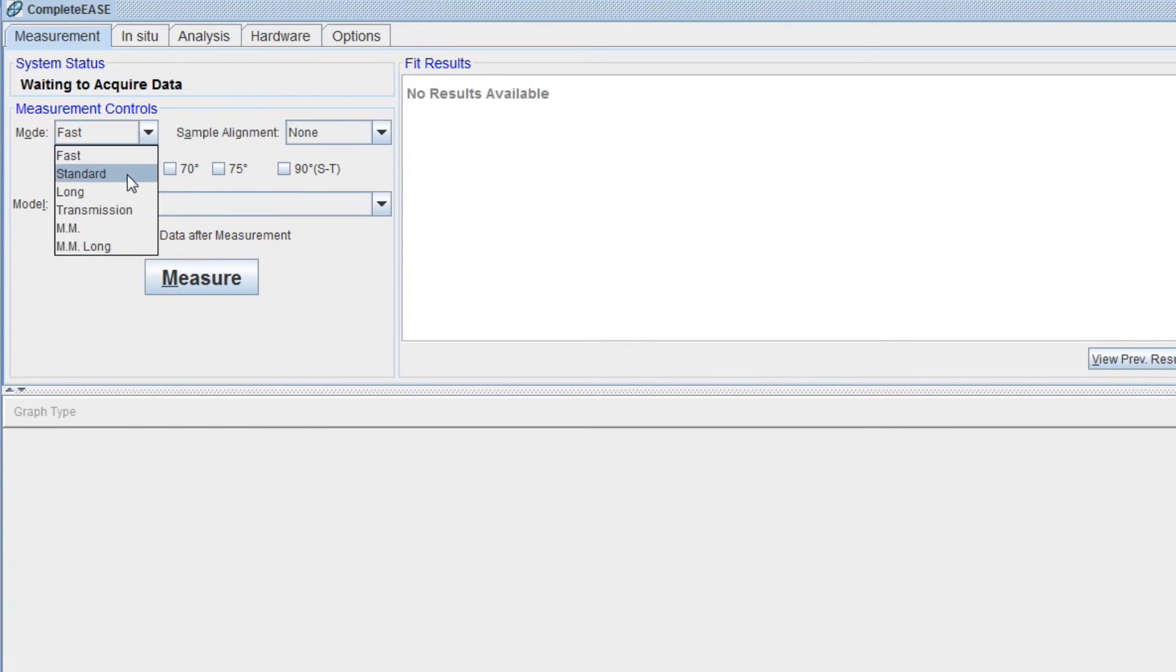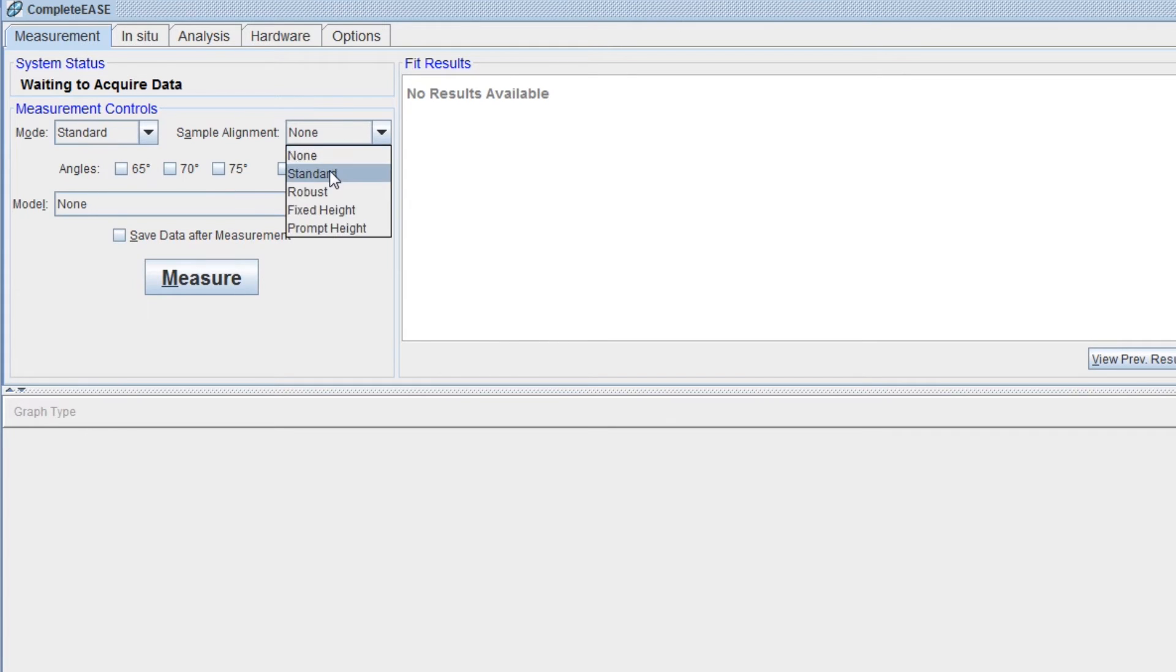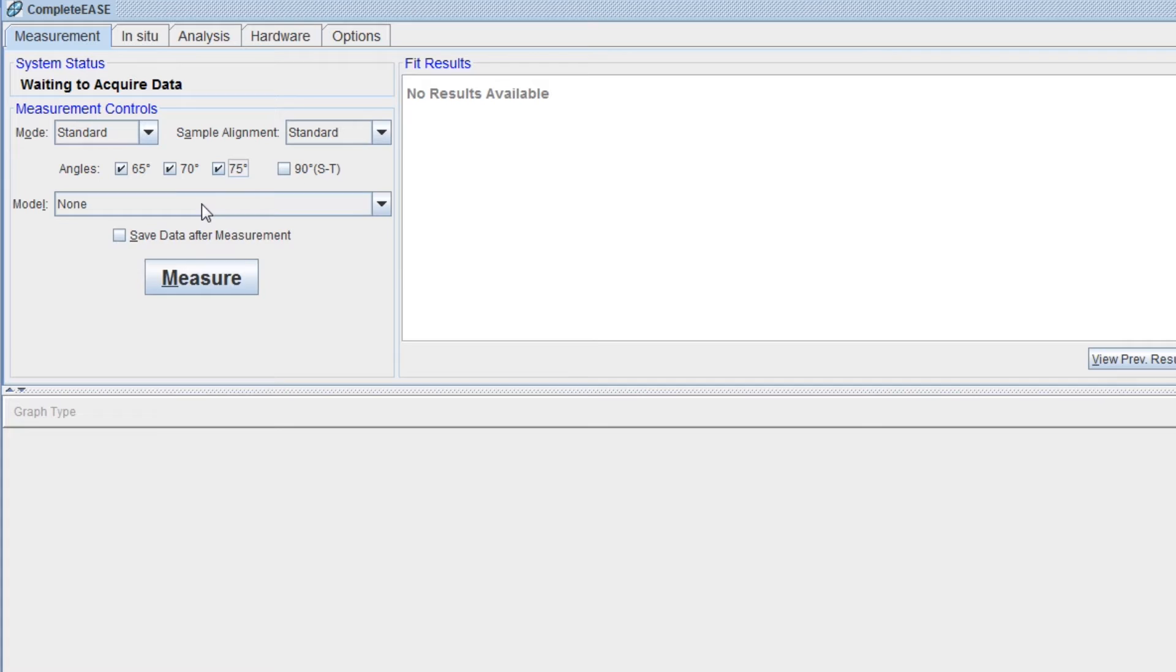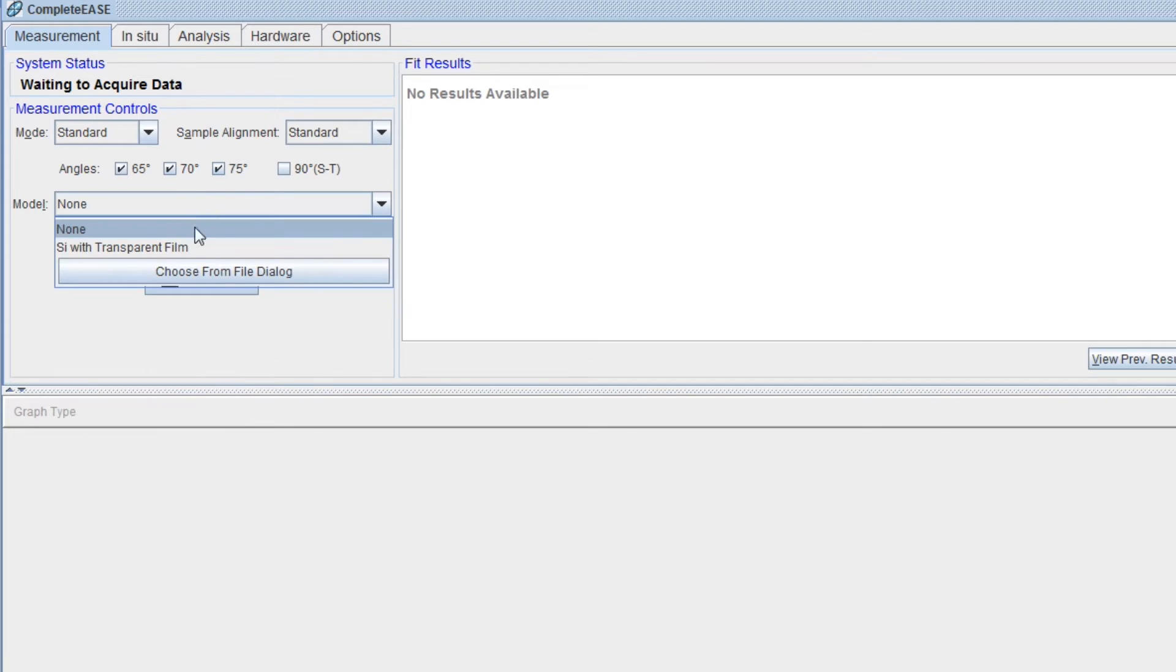Choose the measurement mode, sample alignment type, and desired angles of incidence. You can choose a model that matches your film now or analyze the data later.